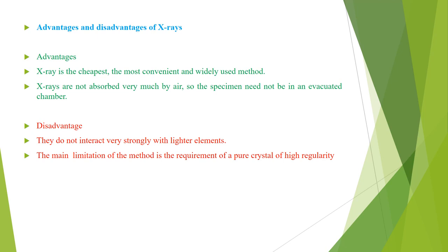The main limitation of the method is the requirement of a pure crystal of high regularity. So this is the other disadvantage, that the method requires a pure crystal of high regularity if we use X-rays as a source to determine the single crystal structure.